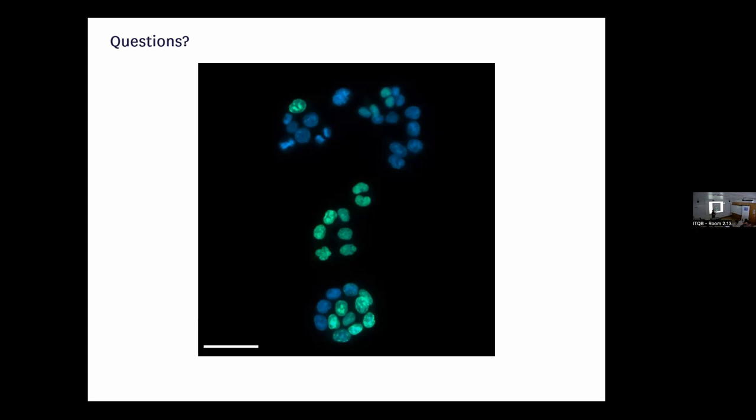You need the first one. Besides the spatial arrangement, they really must be very close to each other. The amount of photons that you need from the final acceptor and its effect on the donor was always limiting. We could never do it. And I'm not aware of it ever being done. There might be something that I've missed, but I have not seen it done. But the good news is that with the new developments in all these fantastic fluorescent probes that are appearing, optimized also for FRET, with a huge quantum yield and a very long lifetime, increasing the possibilities, maybe it's becoming possible. That would be really great.